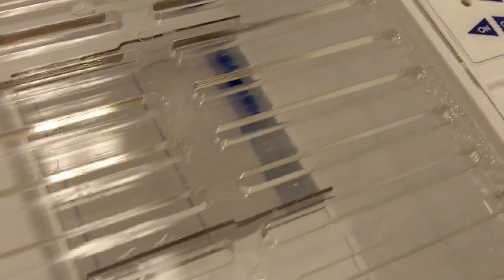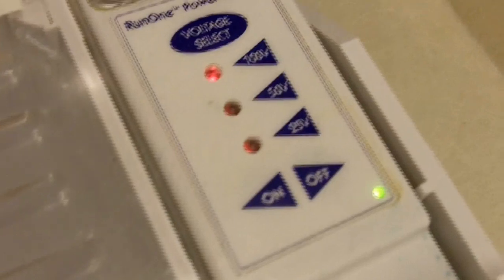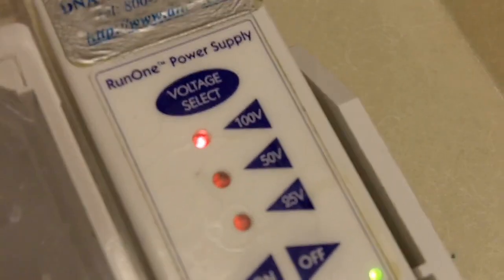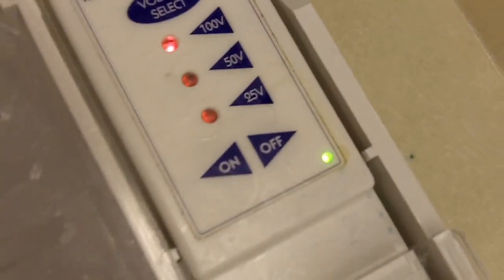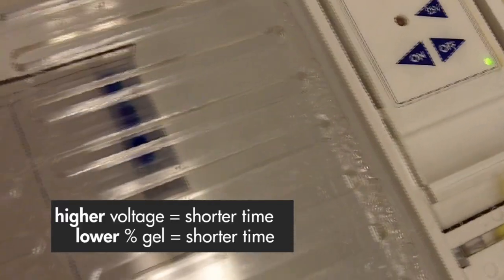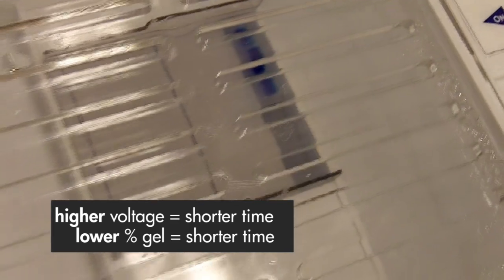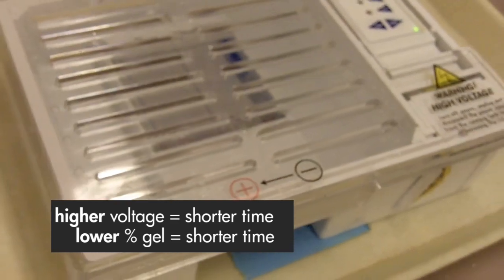Right now the gel is running on 100 volts. The voltage you use depends on how big or how long the gel is and we'll run it for half an hour. The time depends on the percentage of the gel you have and the voltage that you run the gel at. Higher voltage will take shorter time for the DNA to migrate and lower percentage of the gel will require a shorter amount of time for the DNA to migrate.